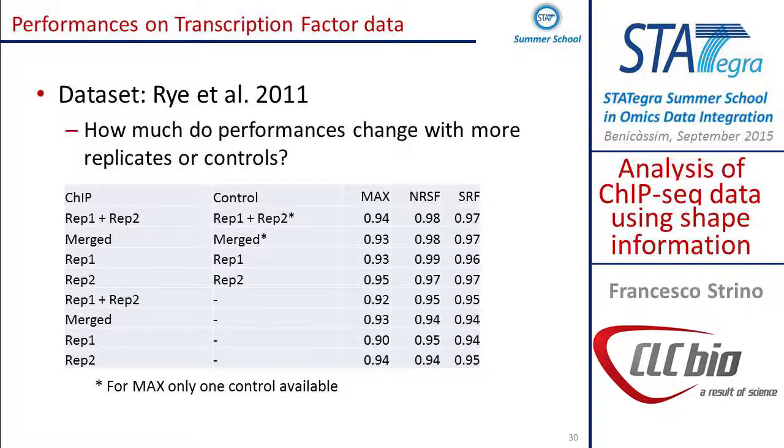Another interesting thing is that if you merge the reads from the replicates, the results are slightly worse than considering them separately. So in case you have replicates, do not merge them before running ChIP-seq in general. Also, most peak callers nowadays let you specify multiple inputs, so that's something to keep in mind. This one shows what happens if you take only 1 replicate: results are about the same. It could even be lucky and be slightly better, but that's just a statistical fluctuation.